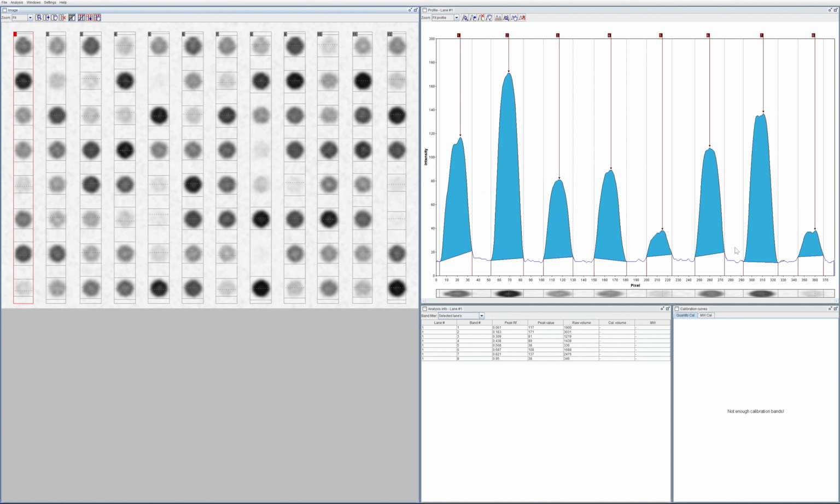that you're looking at. So support for multi-channel image capture is built into a lot of mainstream GelDoc devices these days. Let's see if it's present in GelAnalyzer, and if so, let's see how they handle it, because I've not seen any mention of any normalization function within GelAnalyzer as it is. So I'll grab a new image.